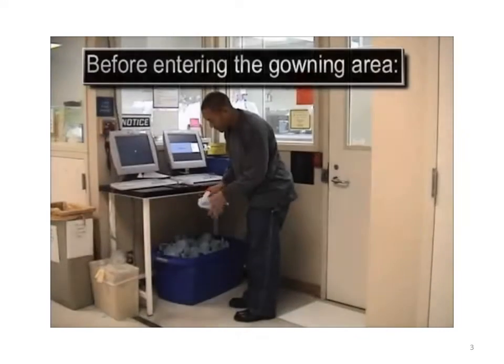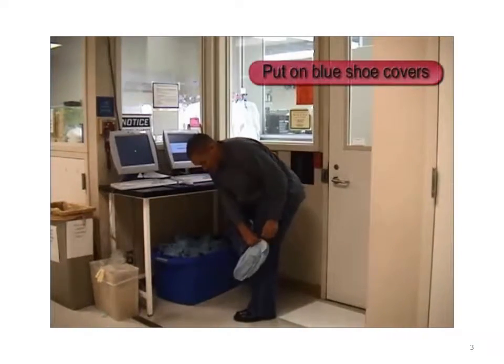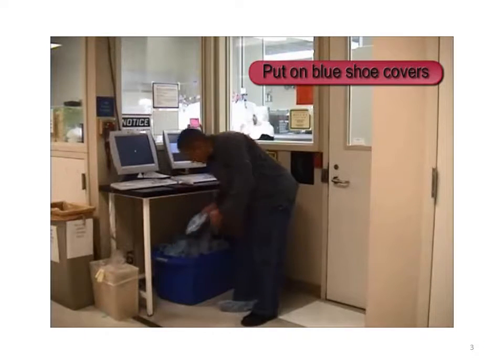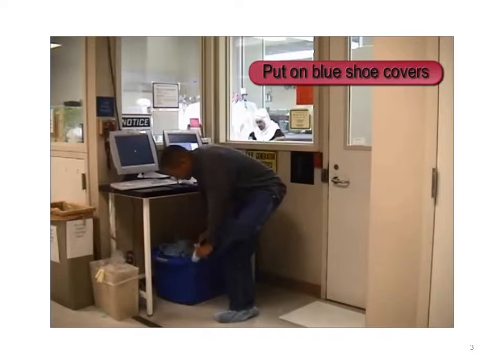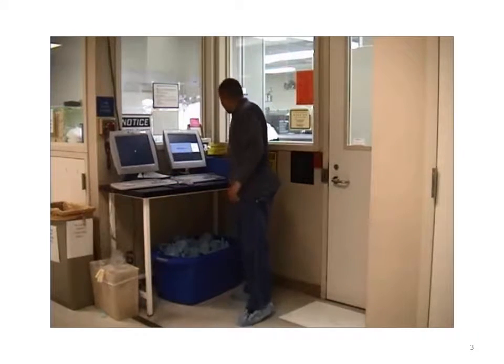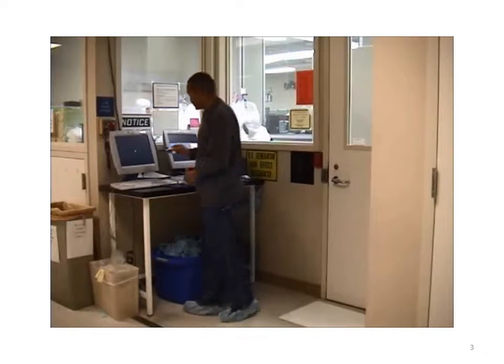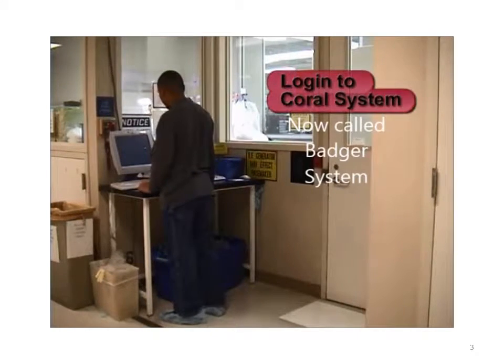Before entering the gowning room, you must first put on a pair of blue shoe covers. They can be found underneath the computer area. Take your Sunray card from the blue bin and insert it into the flat panel next to the screen. Now you can log onto the Coral system.